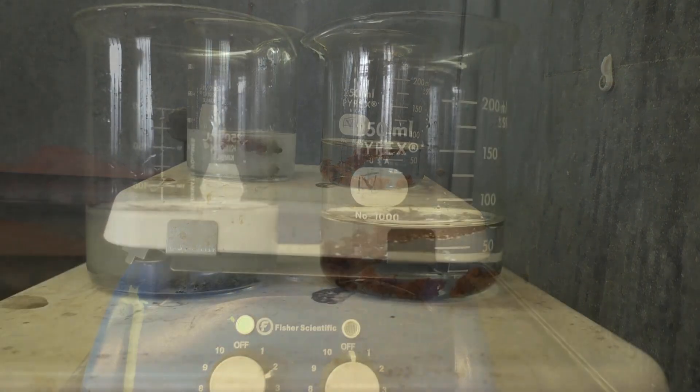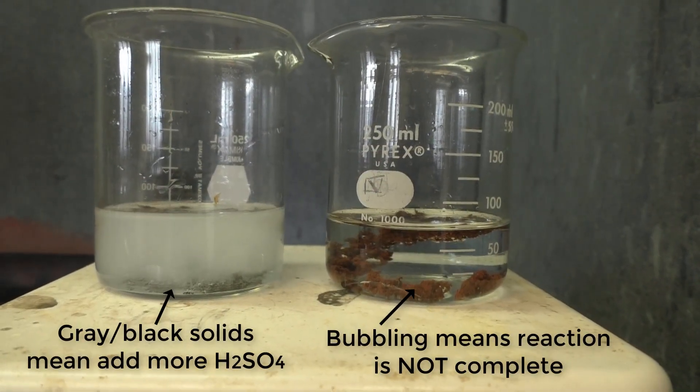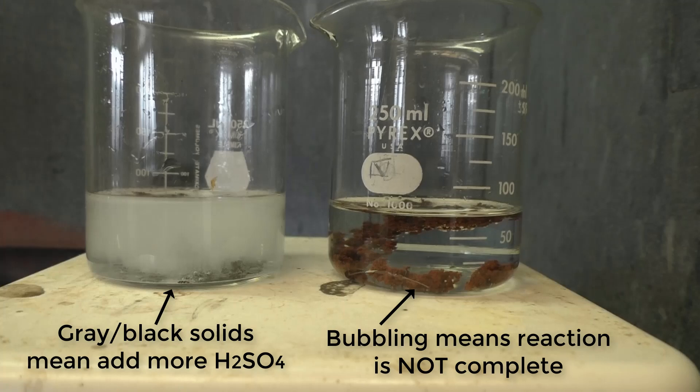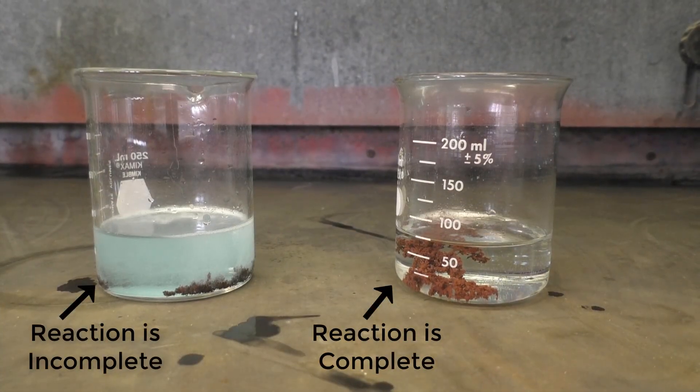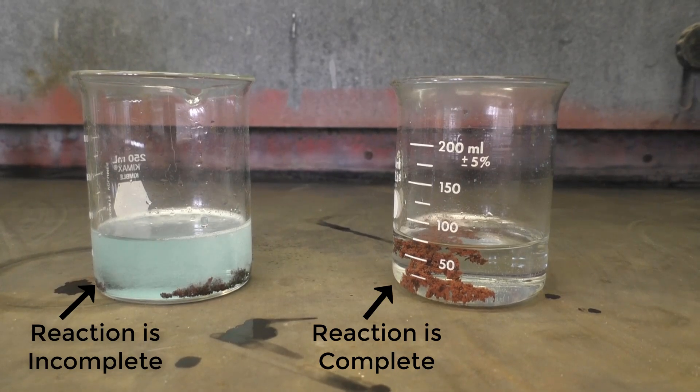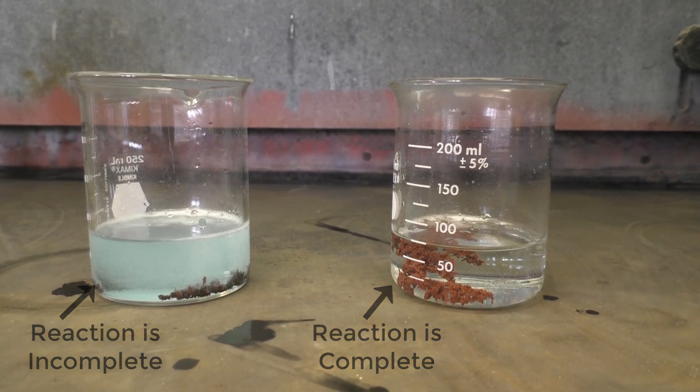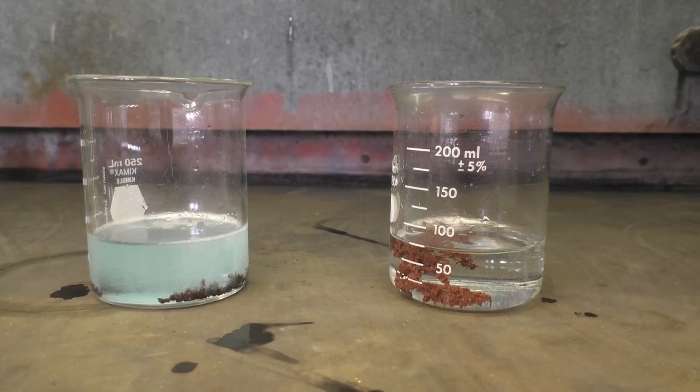And if you have some gray-black solids, this is unreacted zinc. Just add some more sulfuric acid and gently heat your flask in the hood. The reduction of your copper is fully complete when the solution is colorless, has no gray-black solids, and is no longer bubbling.